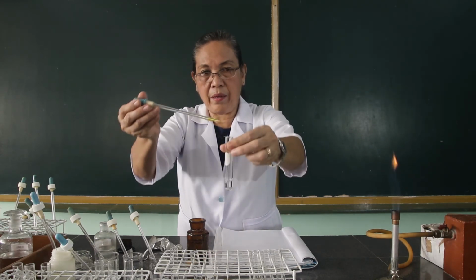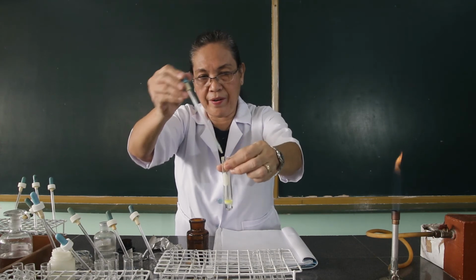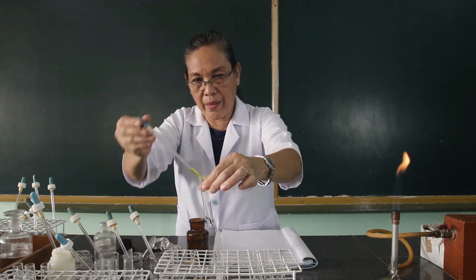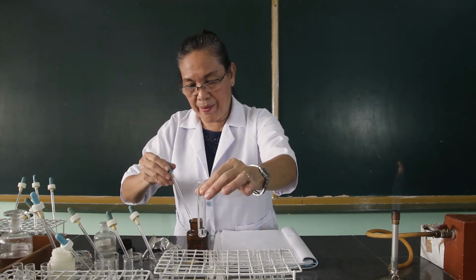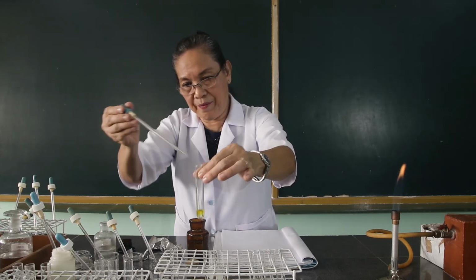Acetic acid. Then we're going to add the potassium chromate. 1, 2, 3, 4.